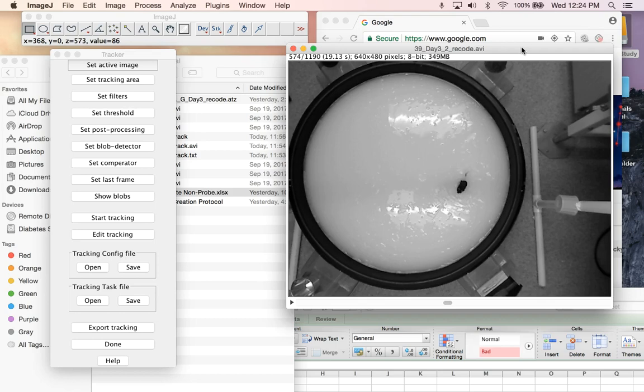I believe that you can kind of see the outline of the platform. It's on the platform for quite a bit. I'd actually back it up a little bit because the moment that counts is when the mouse actually successfully finds the platform. So I believe this right here is when the mouse actually touches the platform.